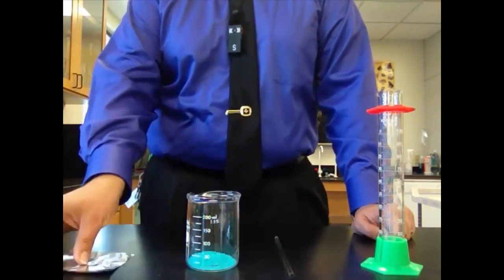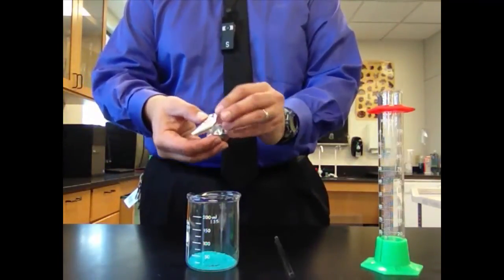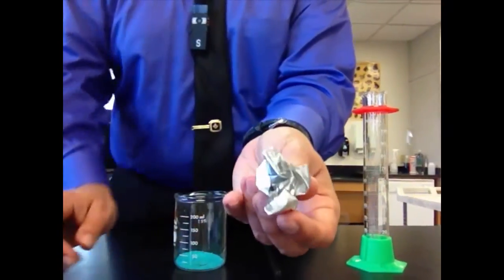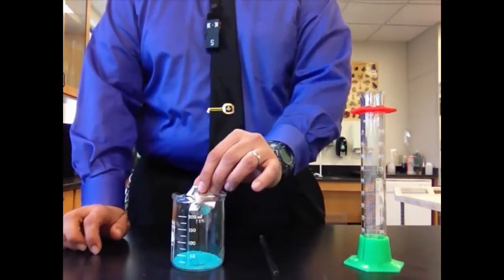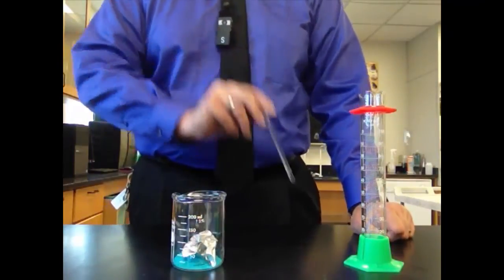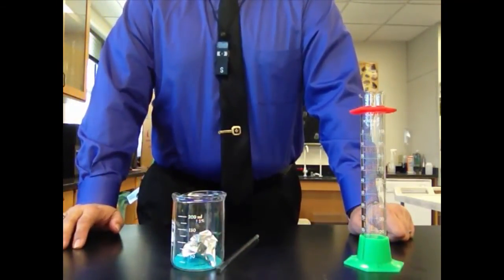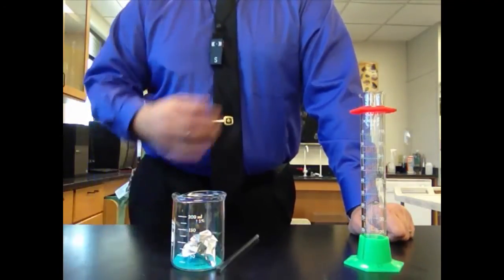And finally, the last thing you're going to do is you're going to take your square of aluminum foil. You're going to crumple it up into a loose ball. A loose ball, not very tight. And you're going to put it into the solution. You can use your stirring rod to push it down. And you're going to observe this reaction. You will have lots and lots of observations that you'll be able to make about this reaction as it's occurring.